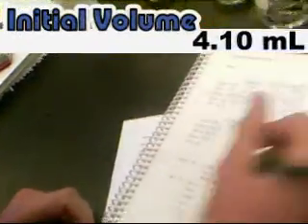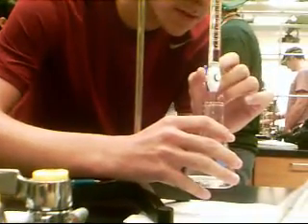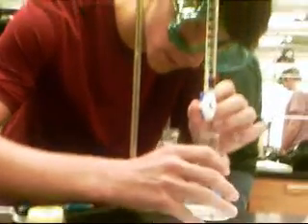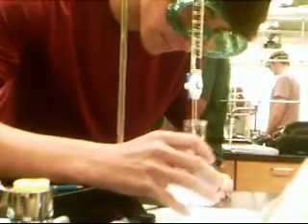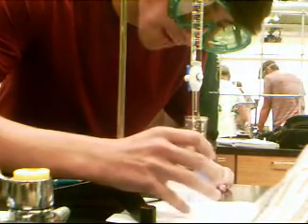Place the Erlenmeyer flask underneath the burette. Open the valve and allow the titrant to flow into the Erlenmeyer flask. It is important to continuously swirl the flask to make sure the solution is well mixed. You will know when the titration is near completion when you start to see a color change. In this case, the indicator solution will turn the solution light pink when it reaches an endpoint.